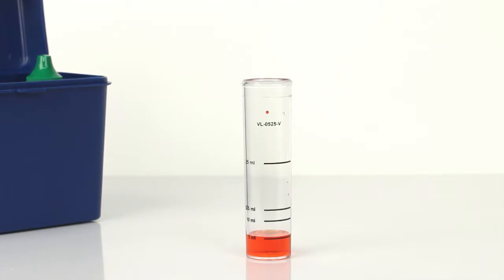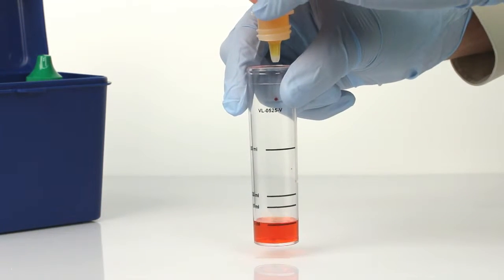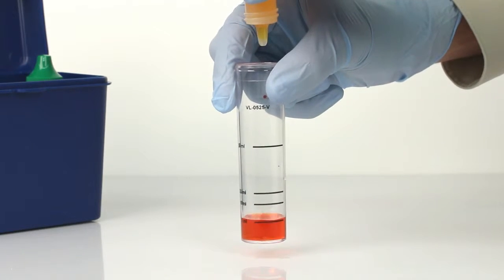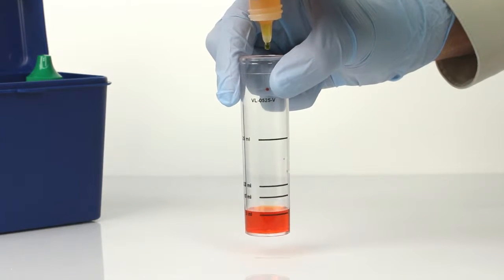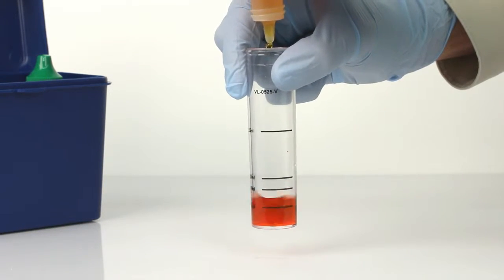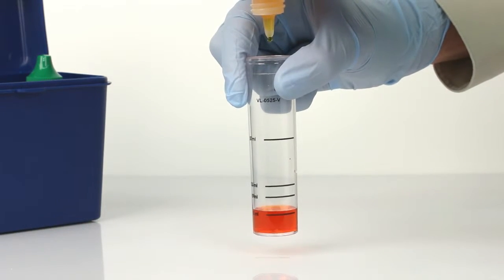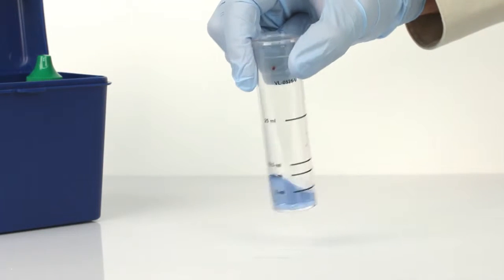The next step is to perform the titration. It's important to make sure you have the proper titrant and sample size for this test. Remember to hold the bottle vertically as you add the titrant one drop at a time. Swirl the vial after each drop and remember to count the number of drops it takes to reach the endpoint. The test is complete when the sample color changes from orange to blue.